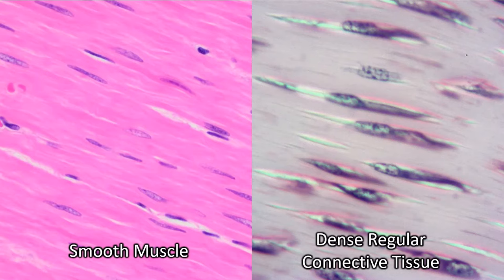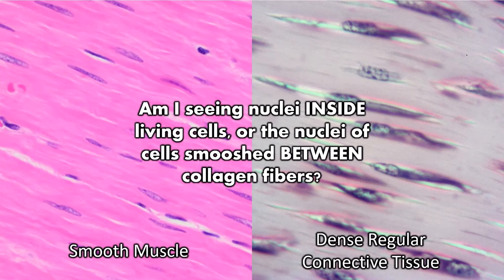The first thing you should ask yourself if you're trying to decide what you're looking at is: am I seeing nuclei inside living cells, which is what you see in smooth muscle? You see all these nuclei are located in the fibers because those fibers are living muscle cells. When you're looking at dense regular, you're seeing cells that have been smushed in between the non-living collagen fibers.